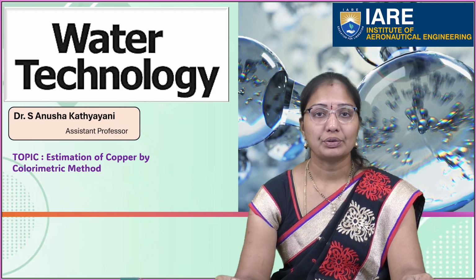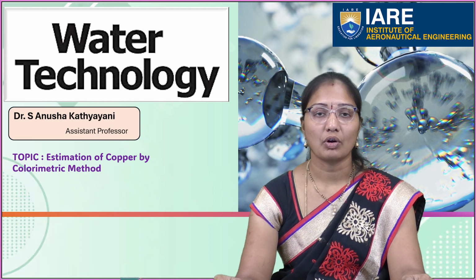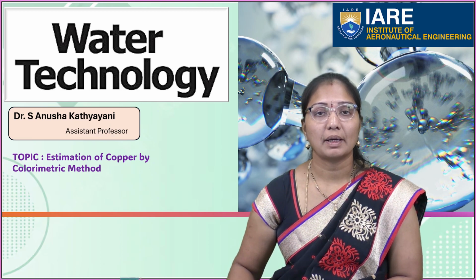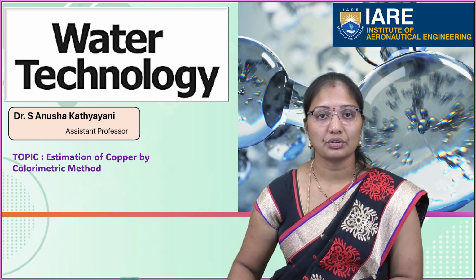Today, we are going to discuss one of the laboratory experiments in engineering chemistry, that is estimation of copper by colorimetry. Here, we are going to measure the unknown concentration of copper by comparing with known concentration standards of copper using the colorimetric method.